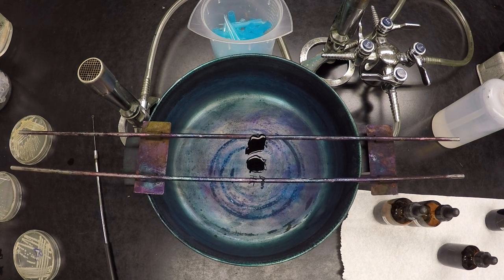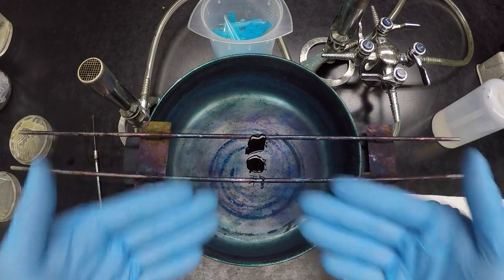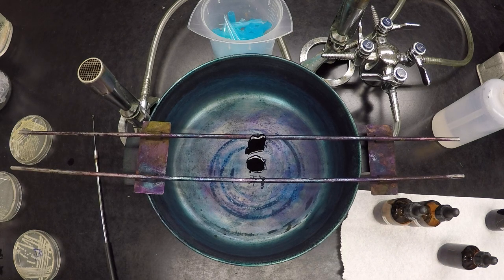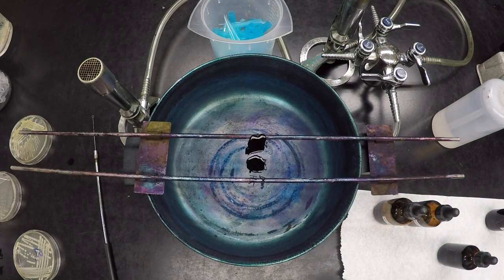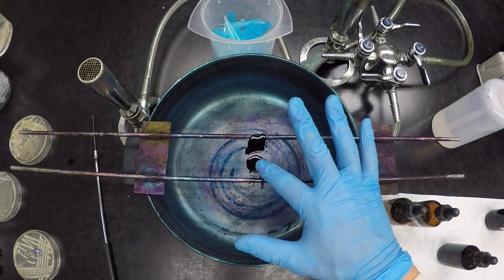Alright, so the crystal violet, or primary stain, at this stage is going to color all the cells, because it's just going to color whatever's on there. Alright, but again, remember, primary stains will always end up coloring whatever's positive. So in this case, we're going to color the gram-positive cells. So once we're finished, that's what the gram-positive cells are going to be.